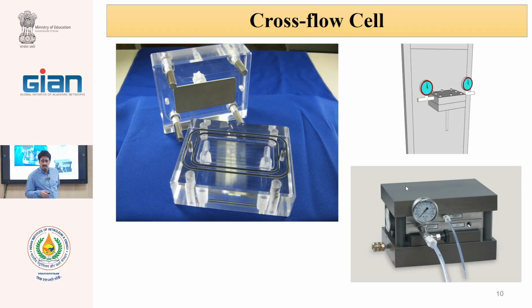When we say our pressure is 10 atmosphere, this usually is 10 point... This is 9.5, 10.5, this is 9.5. Usually we have a pressure drop in the system. Therefore, the entrance and exit are different.